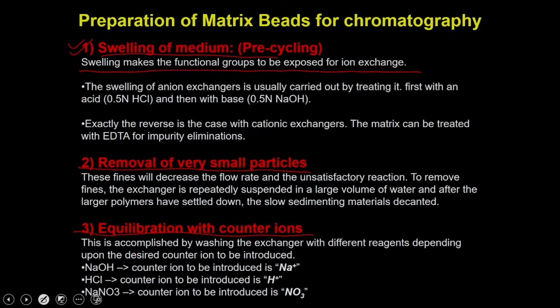Swelling of the medium means you are going to swell the matrix so that it takes up water from the media and exposes its functional group for participating in the ion exchange process. The swelling protocol is different for anion exchange chromatography and cation exchange chromatography.